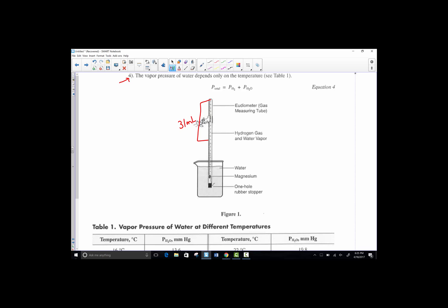Well, inside of this pocket of gas actually contains, the vast majority is hydrogen, but a little bit of water pressure as well. Keep in mind, this is an exothermic process. And so as this magnesium is getting consumed, it's not only generating hydrogen gas, it's also generating just a little bit of water, a little vapor from the water liquid here vaporizing to create gaseous water. So inside of this gas collecting tube where we see this pocket of air, it actually has a mixture of the hydrogen gas we bubbled from the reaction with a little bit of water pressure as well.